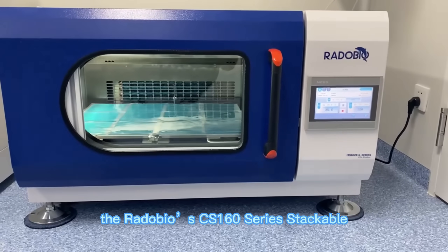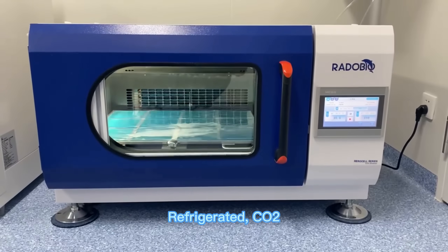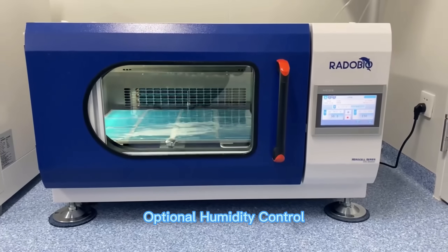Shaking Incubators: the Radobeo CS160 Series Stackable Refrigerated CO2 with UV Sterilization and Optional Humidity Control.